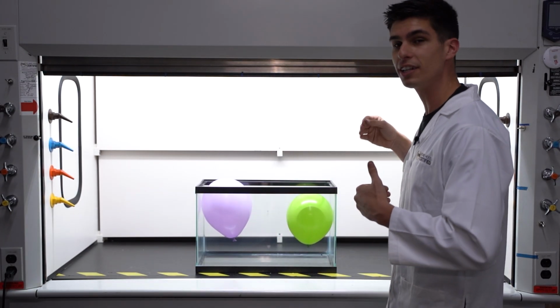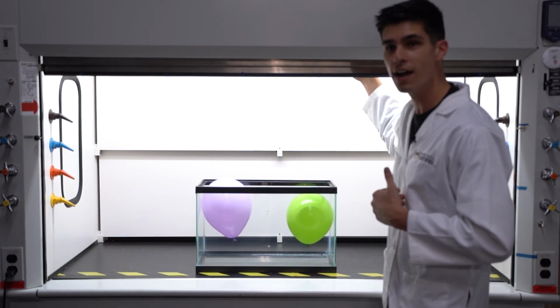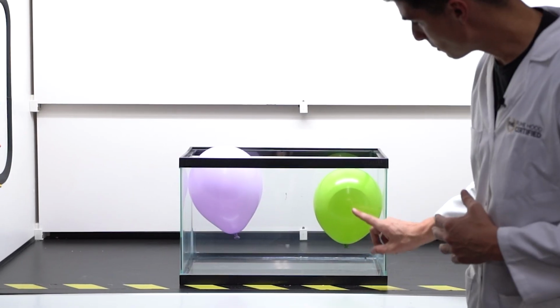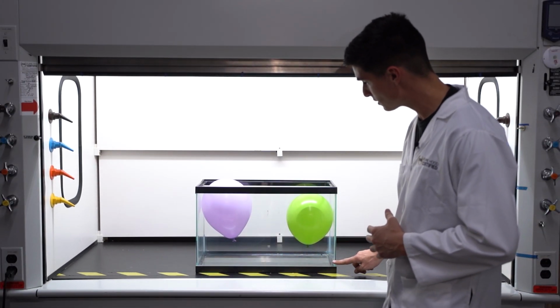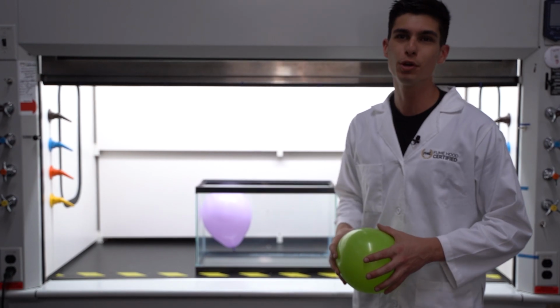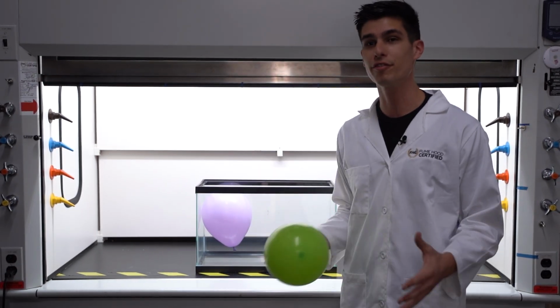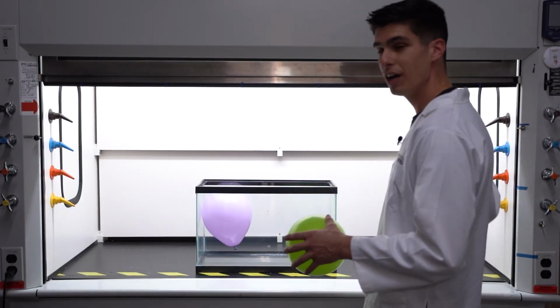When you want to test and get accurate and proper readings in those areas that are more high, all the SF6 is not moving the balloons, and the balloons are still floating on our invisible layer of SF6. So all the SF6 has to be down in the bottom of the fish tank. It's an interesting experiment to test the power of the fume hood versus the density and the heaviness of the SF6, the very gas that we use to supposedly test the entire hood.